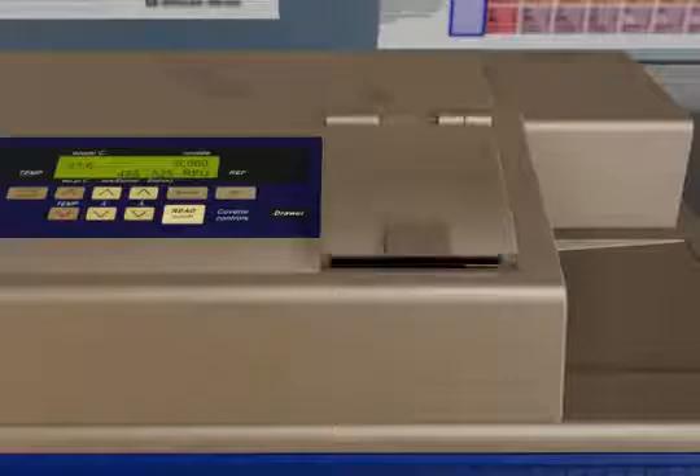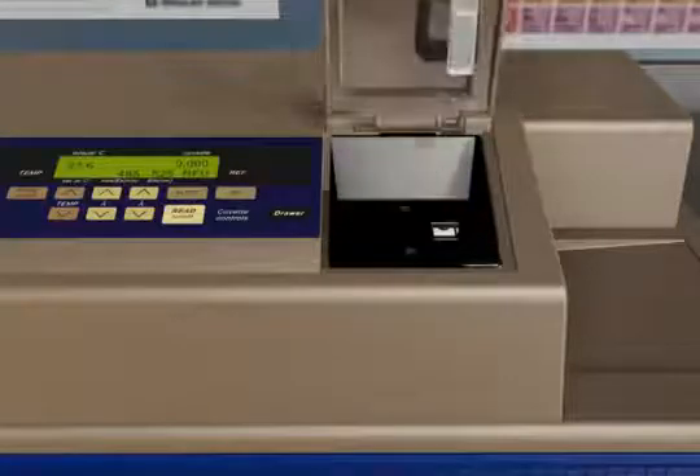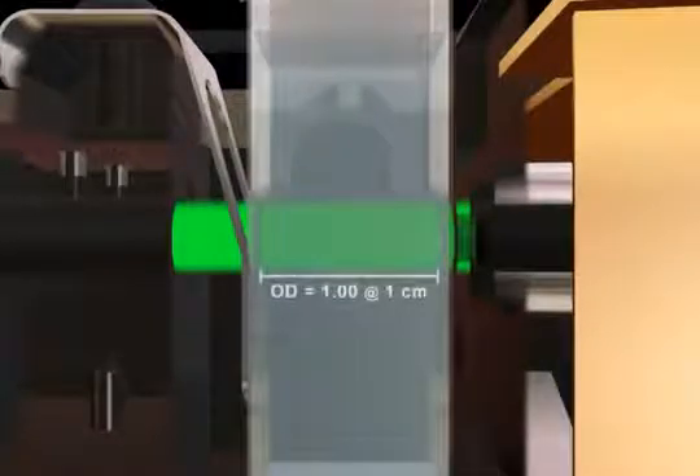SpectraMax's multi-mode cuvette port allows us to explain our patented PathCheck path length correcting feature. When reading cuvettes, the path length is known to be one centimeter. This is not the case with microplates. Path lengths can vary due to pipetting errors, evaporation, or desired assay volumes.